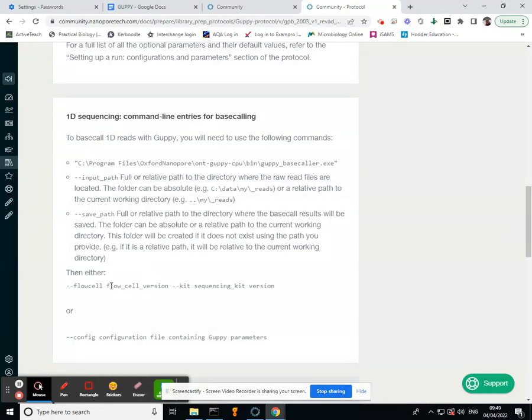And now your flow cell—you're going to have that MIN, I think it's underscore 106 or 107, and then your RAD dash 004. Yeah, everyone's using that same kit.